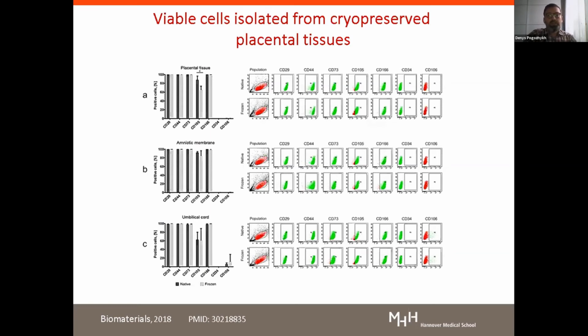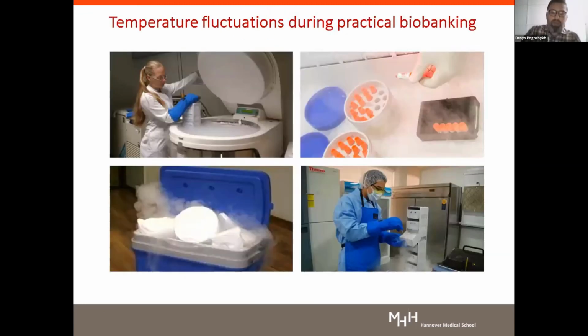This is not a cryopreserved cell suspension, but really cryopreserved tissues, and after freezing, we were able to isolate the cells. All this work has been performed for several years, and during these years, we and our partners noticed that while we have the same primary culture, at different points of the research we have different viability rates, and sometimes cells look better objectively, sometimes worse, and behave a little bit differently. And then we had an idea about what happens to it.